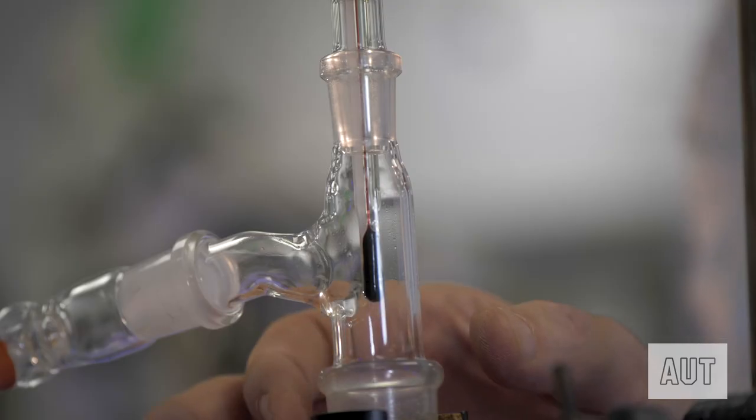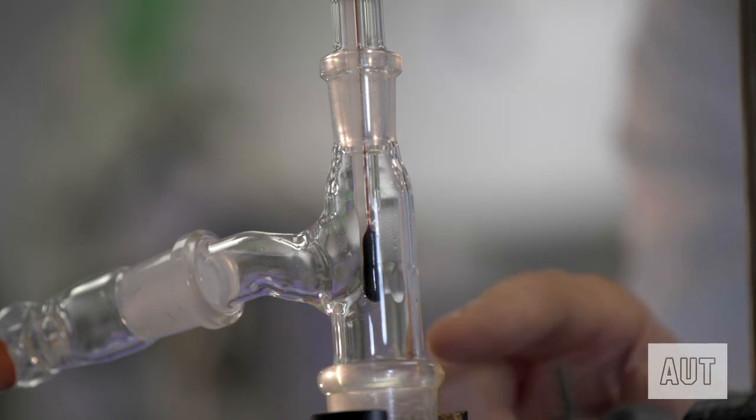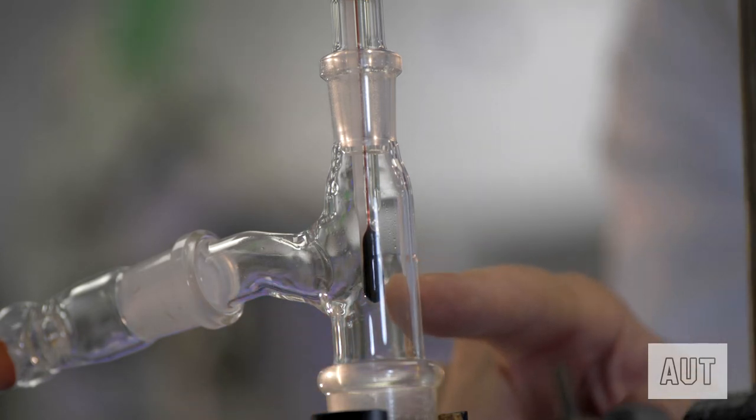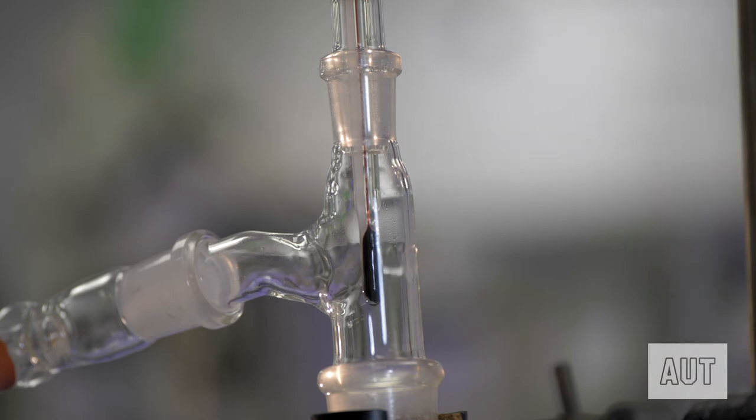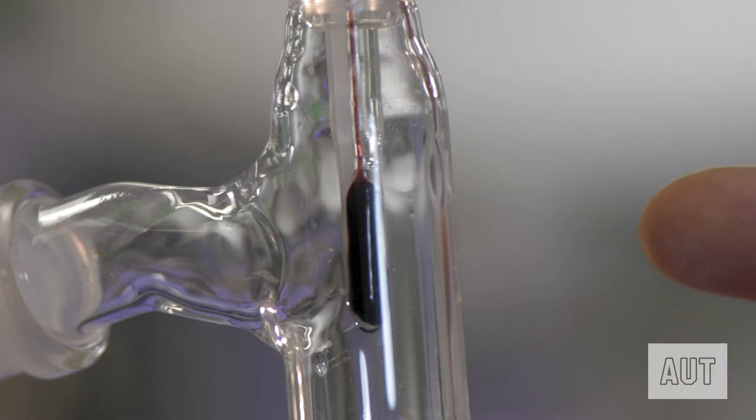And what will happen, and obviously I can't show you this. Oh, there it goes. There is your vapor going up there. You may be able to see that. It's just hit the end of the thermometer now. And so the temperature's going up and up. And you can see the vapor now dripping off the thermometer.